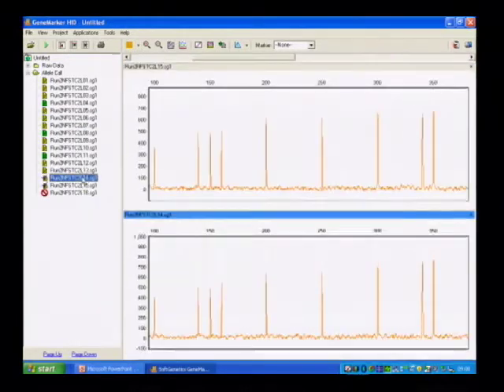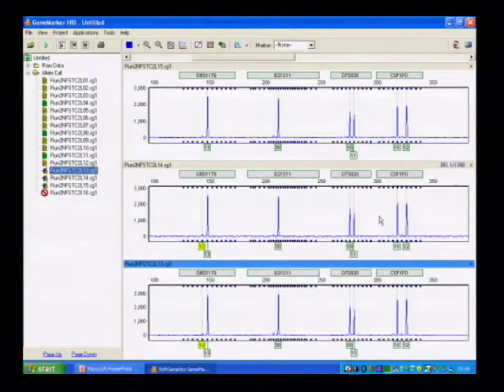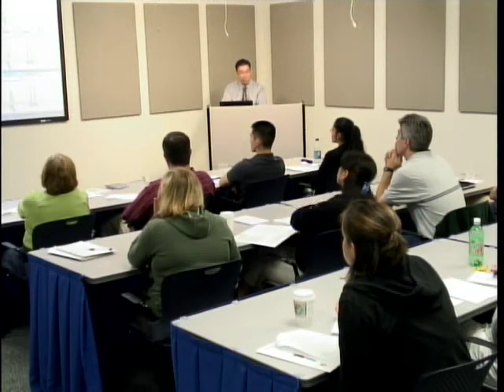We can look at the 1 nanogram samples, which were loaded in lanes 13, 14, and 15. For the blue traces, you see that we're getting signal strengths for the heterozygous ones of around 1500 RFU. And this is 1 nanogram of input. This software doesn't have stutter elimination thresholding, so what you will sometimes see is stutter being called as well. That's what this 12 and 12 allele is. So this is 1 nanogram.